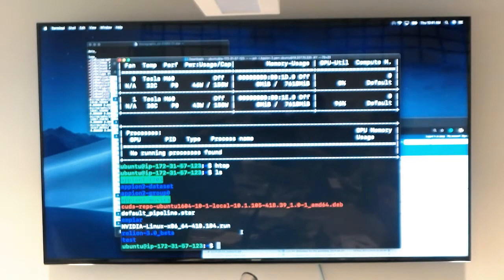When you're starting to do processing, data expansion can occur very fast, and you need some sort of naming structure in case you don't have your lab notebook with you, or you're doing several different branches. Like, okay, this is a dead end branch, I'm going to work back to some point into the main trunk and then work out again. That's easy to say, but that might not be easy to do.